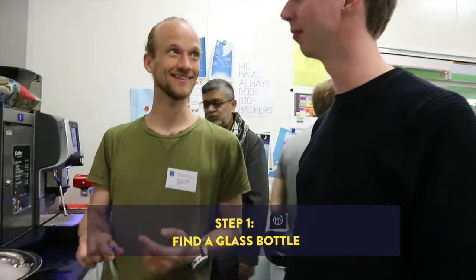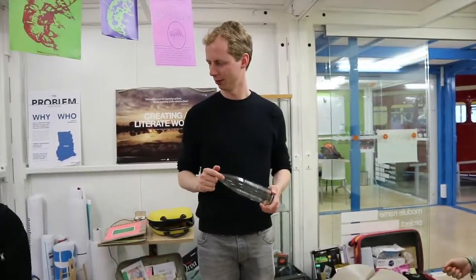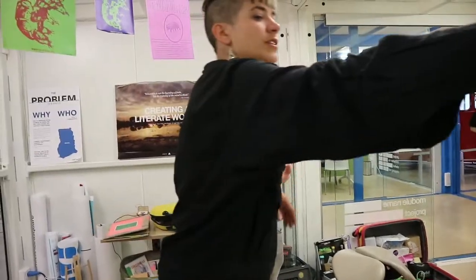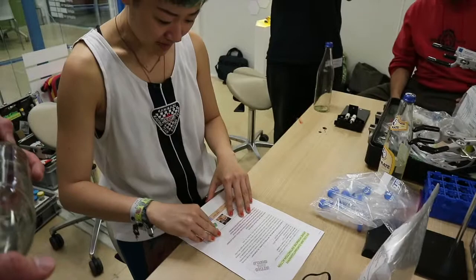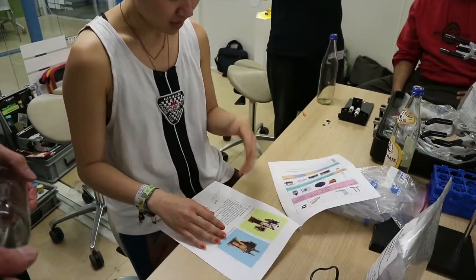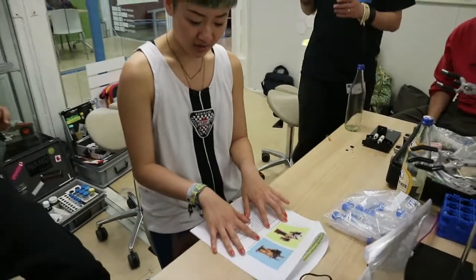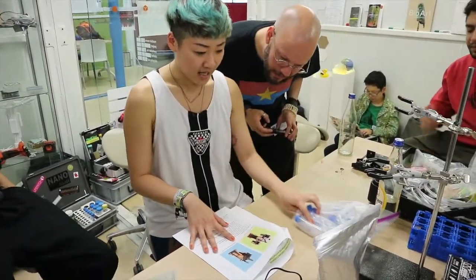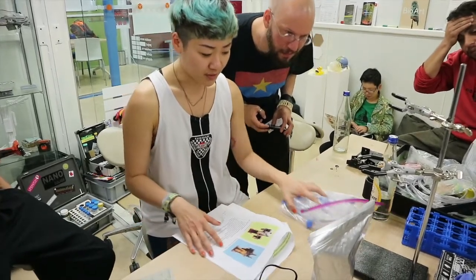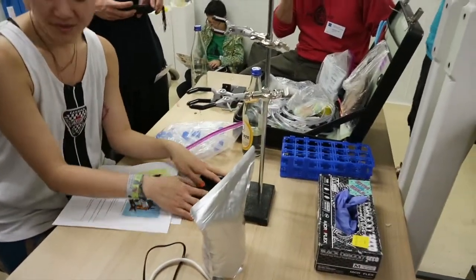We're going to use it as an extraction column to extract hormones from our pee. So here we're going to do the workshop. Peter, are you excited? About seven and a half. Something new is always fun. Here are all the things that you need. And this is the DIY column construction, but I decided to bring less hardware with me — I actually just have the real thing. This is what the laboratories use.